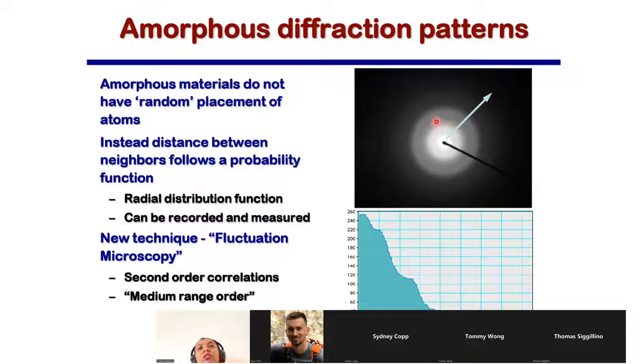I worked a lot on this during COVID, but unfortunately that work didn't get completed because I was involved with other projects. I was working on some intermetallics where I was trying to measure the amount of amorphization happening in these samples by these diffraction patterns. And you can do that. There's a clear mathematical formula available, and you can simply know your value of order and disorder. Normally zero is when your material is fully ordered, I think the disorder is zero, and when it is fully disordered, you will say it has a disorder of one. From zero disorder to full disorder, it goes from zero to one, and you can take this value out. Anyone who has interest, I can show you those images.